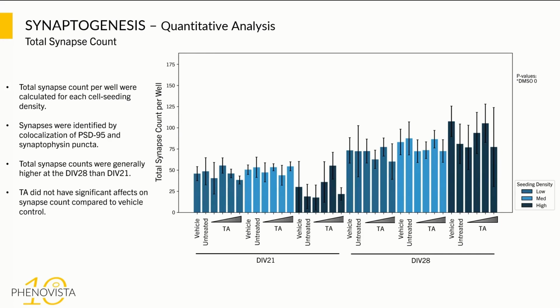So a lot of these assays, we have a similar approach, but by changing out the timing, the types of cells, the culture conditions, or what we're staining for, we can answer a lot of different kinds of biological questions.